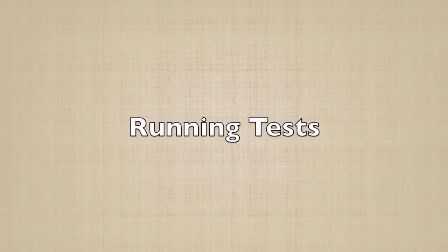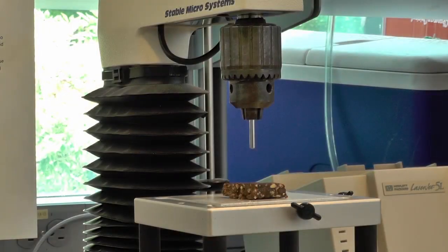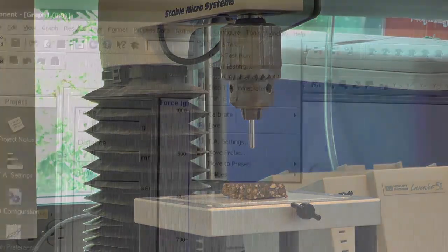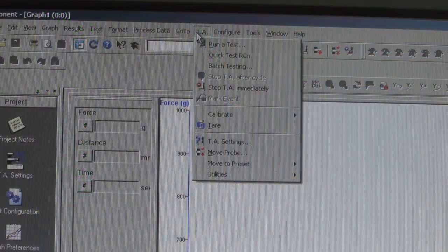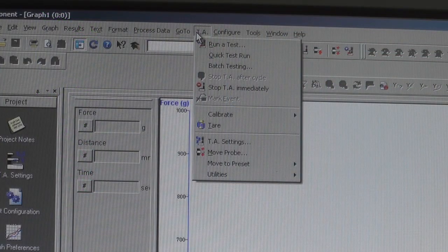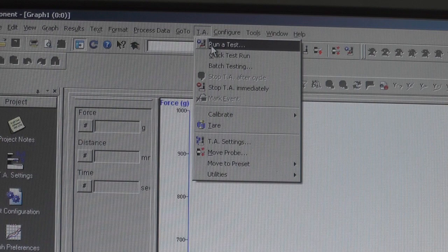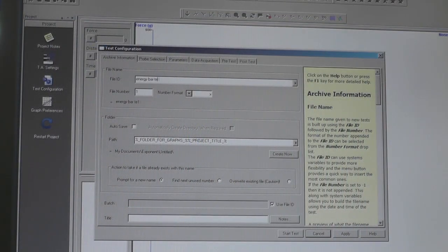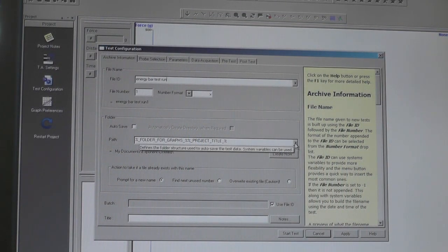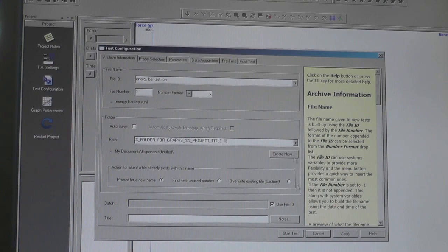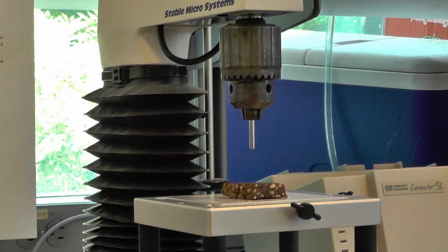Now you're ready to run your tests. Load your sample on the platform and click on the TA tab on the computer. Select Run a Test. Name your test and choose the folder you want to save your results to. Click Start Test and the instrument will start running.